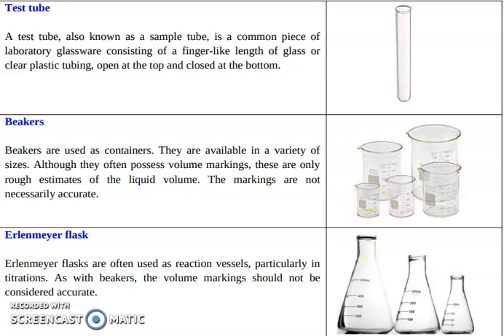Now another glassware you can see, Erlenmeyer Flask. Erlenmeyer Flasks are often used as reaction vessels, particularly in titrations. As with beakers, the volume marking should not be considered accurate.